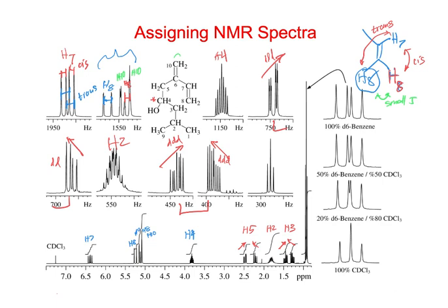And so those would be, let's see, H5 would be here. Yeah, it looks like it should be mostly a doublet of doublets, right? Maybe it has some allylic coupling up to H10. And for H3, those should be very clearly, they're going to couple to each other, so that's a doublet.